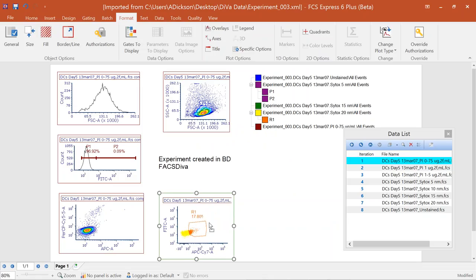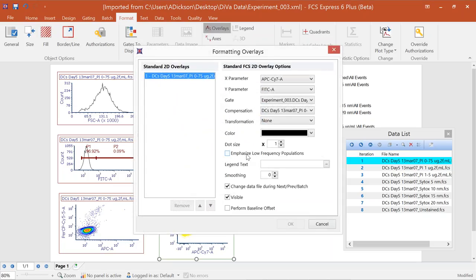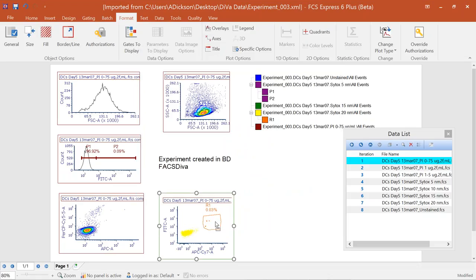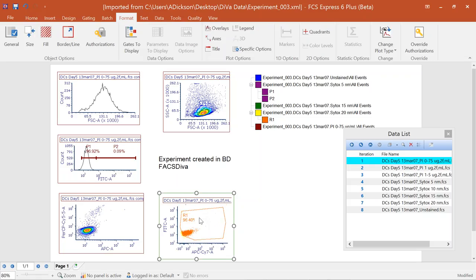Another useful gating tool is the ability to emphasize low-frequency events. Under the format overlays options, choose Emphasize Low-Frequency Populations. For events under 2% of the gate, the dot size increases so you can see those populations more clearly. As you move the gate and the population exceeds 2%, the display updates accordingly.